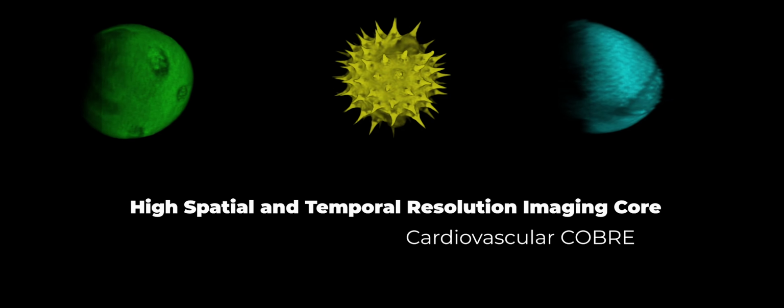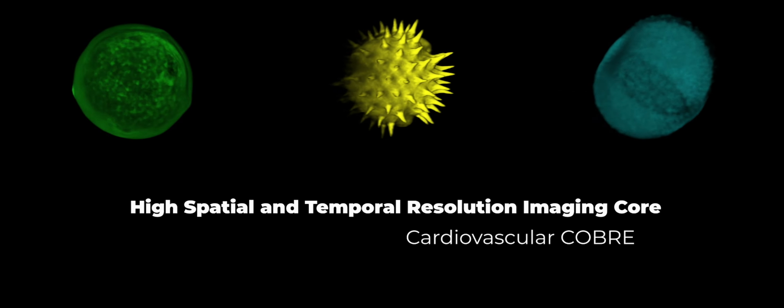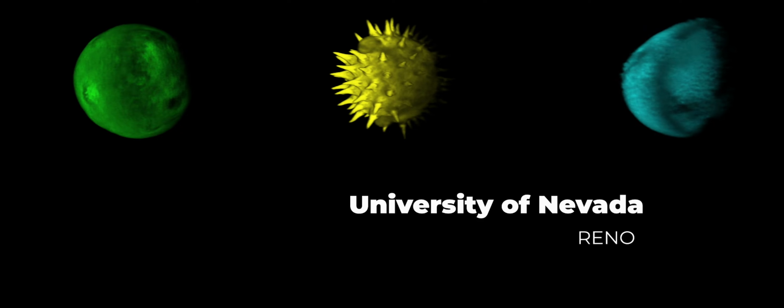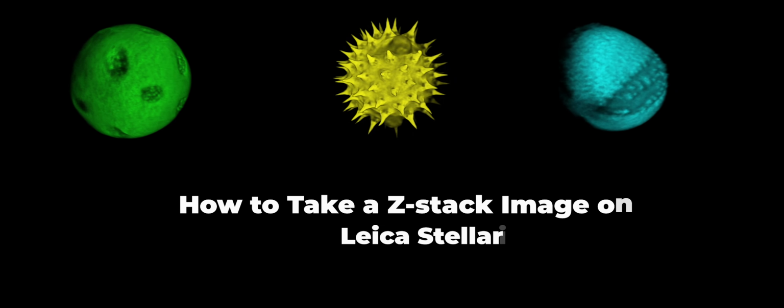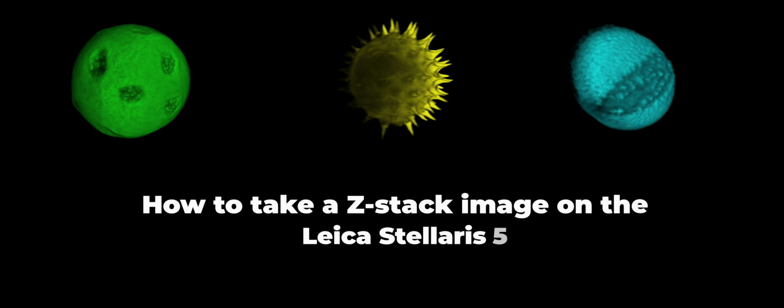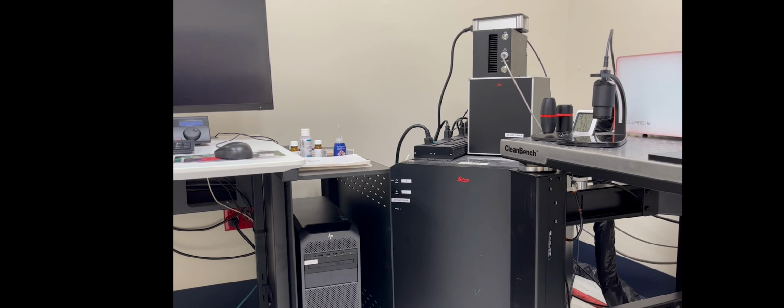Hello, and welcome to this tutorial by the High Spatial and Temporal Resolution Imaging Core at the University of Nevada, Reno. And in this video, I'm going to take you through how to take a Z-stack image on the Leica Stellaris 5. So the first thing we need to do is turn on the system, and it's really easy.